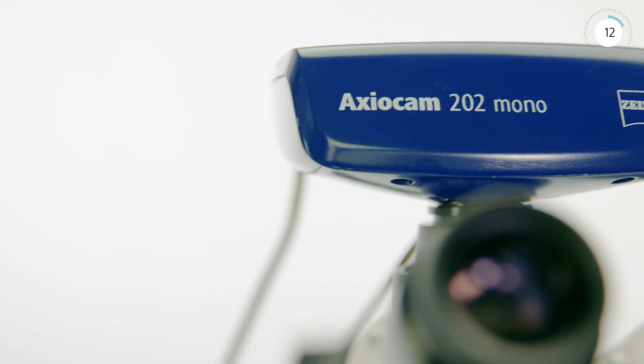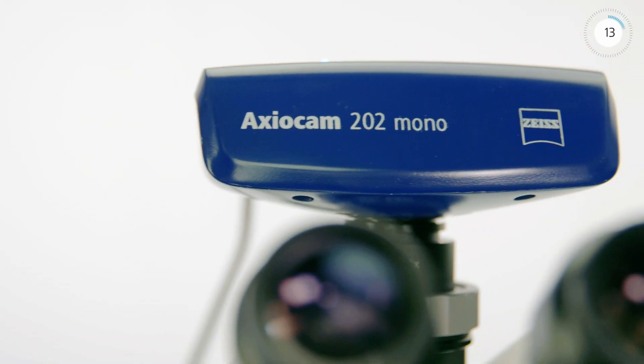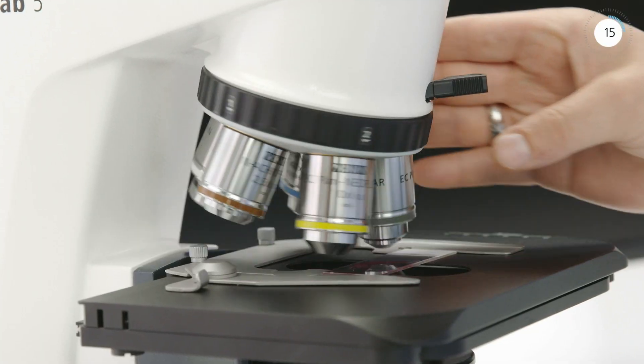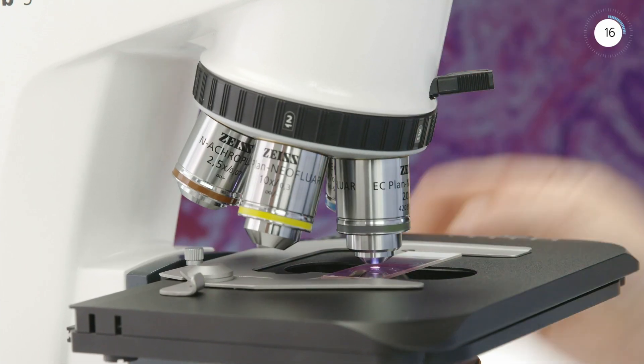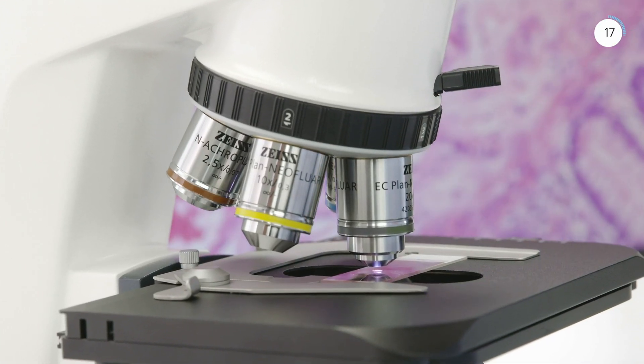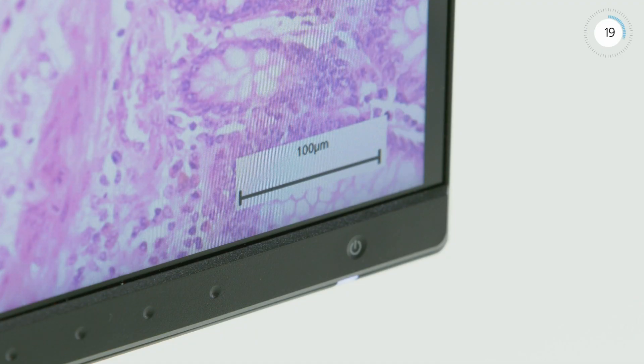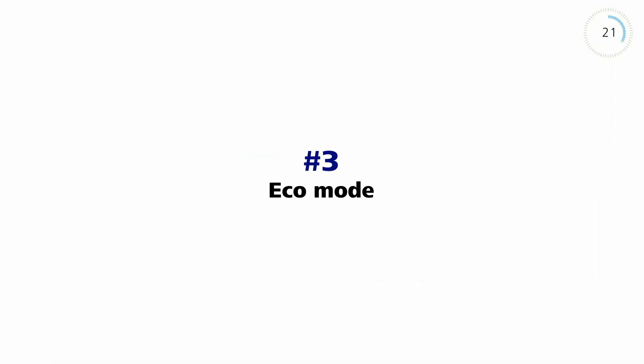Axioscope 5 offers integrated encoding of nosepiece, reflector turret, and LED light sources. Your image data is saved with the correct scaling and metadata.